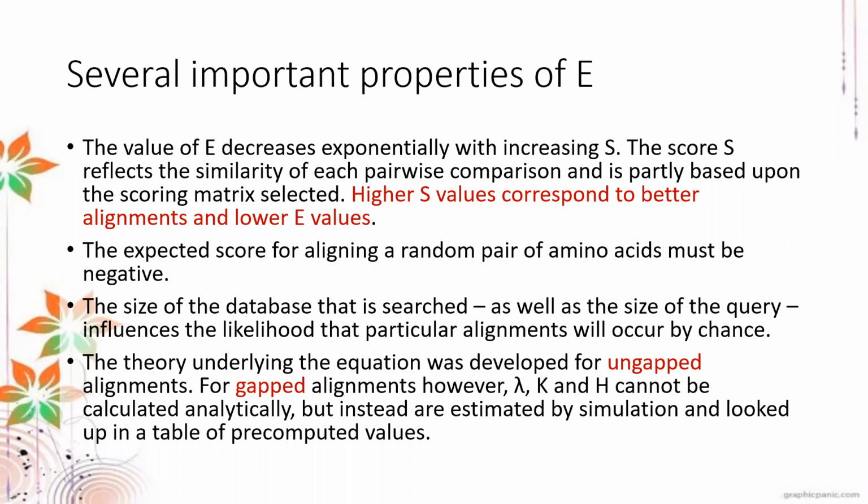So you have a higher E value. So that's basically how the effect of the size of the database goes. And that goes also the other way around.